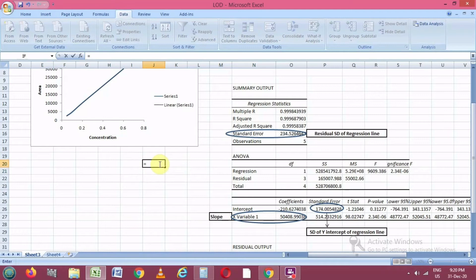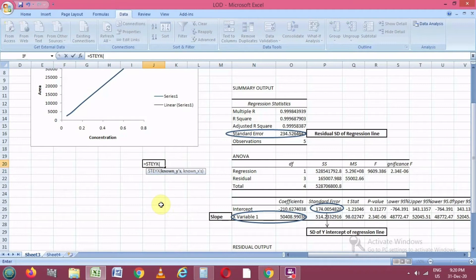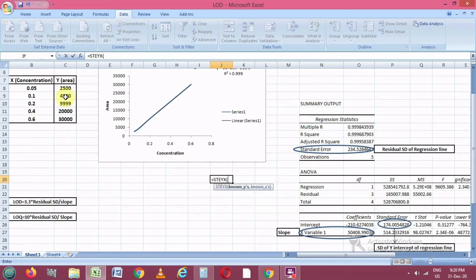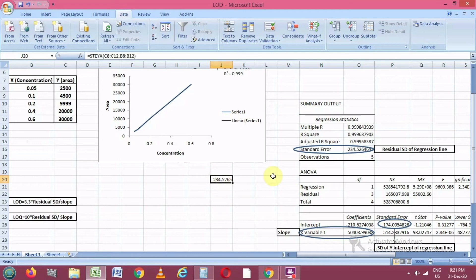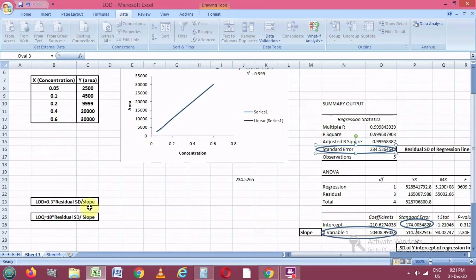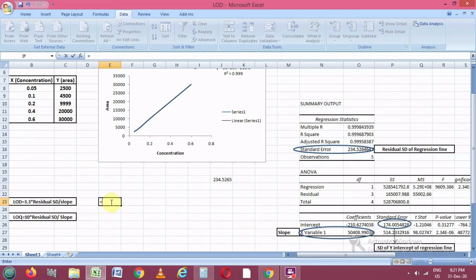Based on the ICH guidelines for calibration curves, a specific calibration curve should be studied using samples containing an analyte in the range of the detection limit. The residual standard deviation of a regression line, or the standard deviation of the Y-intercept of the regression line, may be used as the standard deviation. This means we do not use the normal standard deviation — we use the standard error values from the regression output.